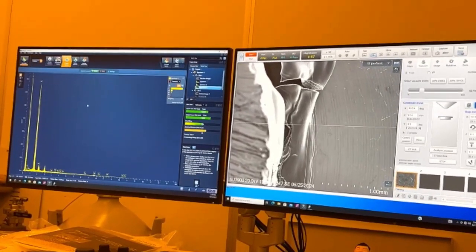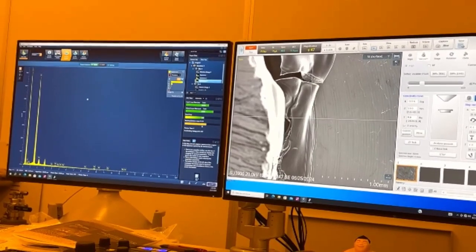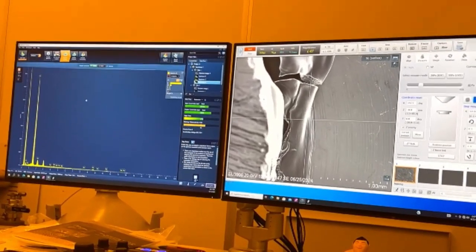That's the pump that we picked up. So that noise we're hearing is the air compressor. So like I said, you might hear that kick in once or twice a day.